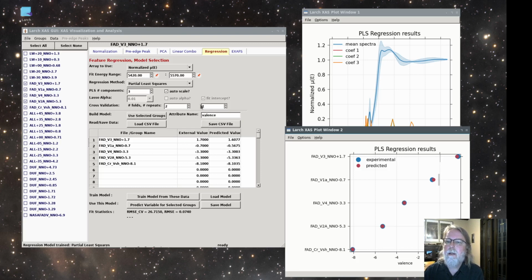I should say that there's a couple of other variations on how this could go. So you could use a lasso technique or partial least squares. For most of what I'm showing you here, it doesn't matter in much detail what linear analysis method is used. You still map each of these spectra to a single value that is in a range.